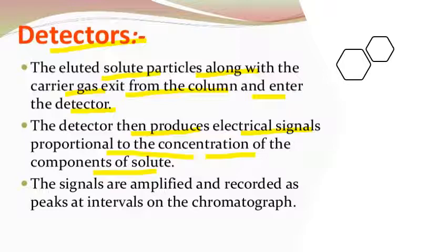These signals are amplified and recorded as peaks at different time intervals on the chromatograph.